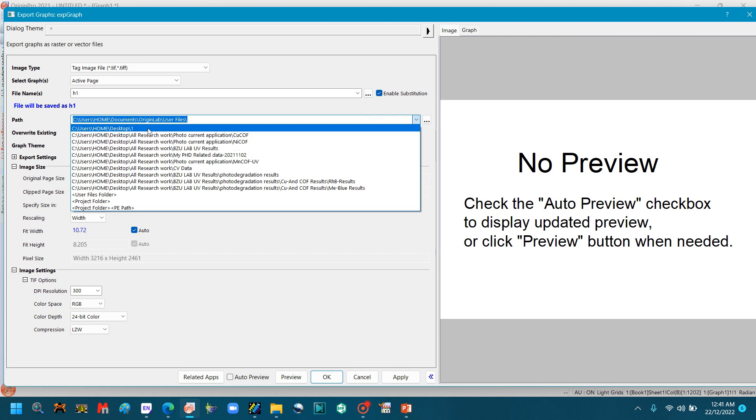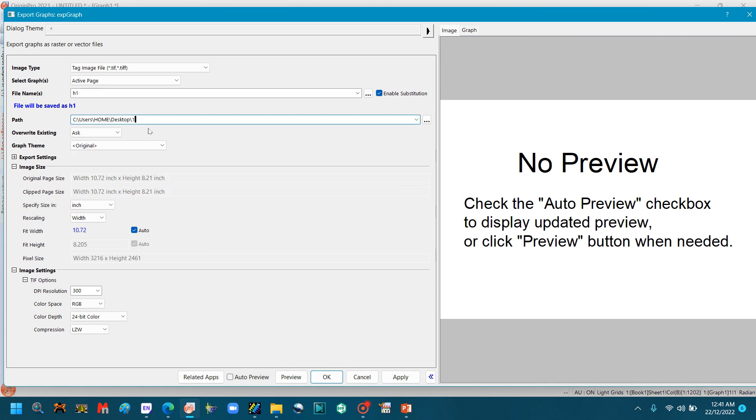Select the path. We have already used this path, so this is mentioned here. You can change the path by clicking this three dots box and change the path. So after selecting the path, click OK.